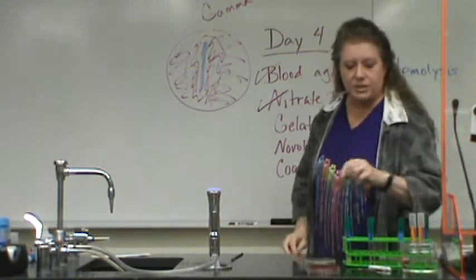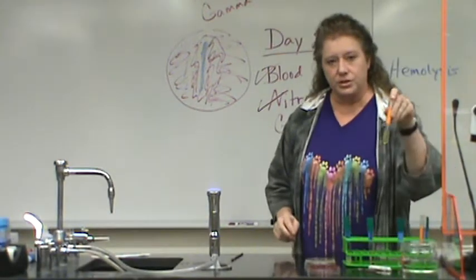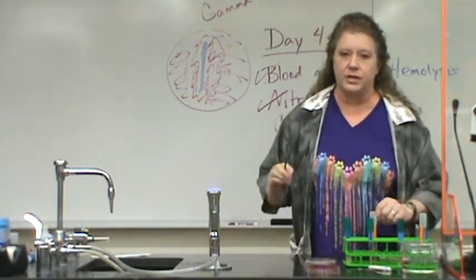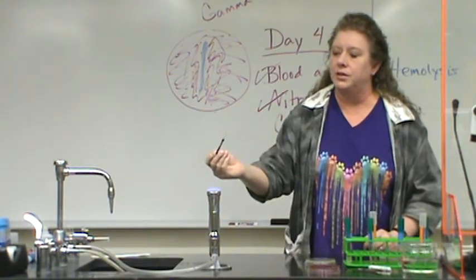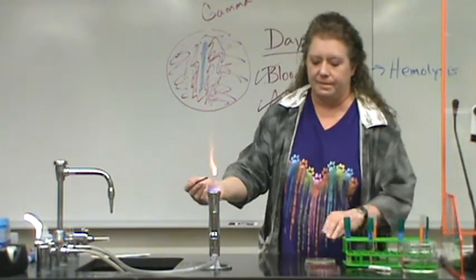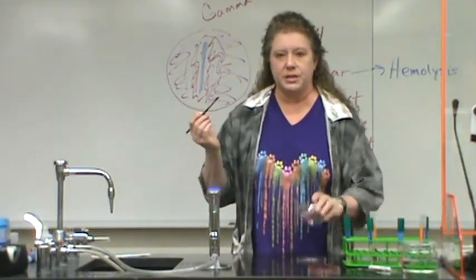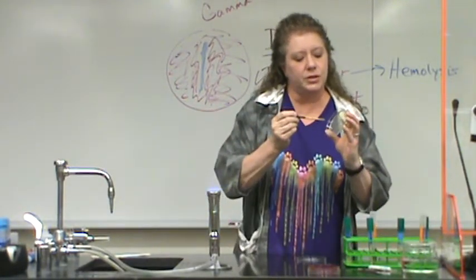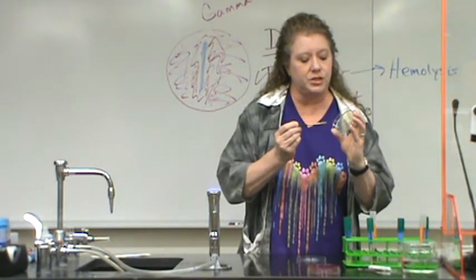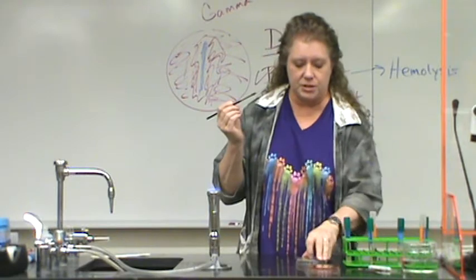All right, next, the gelatin tube. Okay, you have done gelatin tubes before, so you will know how to read the results of it. You also know how to inoculate it, but we'll quickly go over it. Sterilize your loop. Pick up your TSA plate, cool it where there's no bacteria. Remember, you need quite a bit of bacteria again for this one, so get a clump of bacteria.